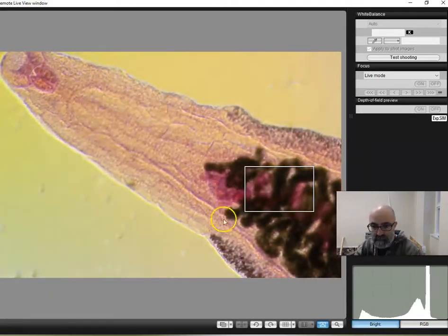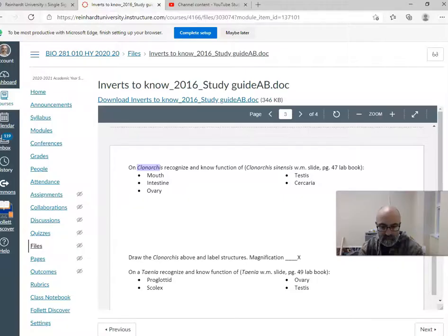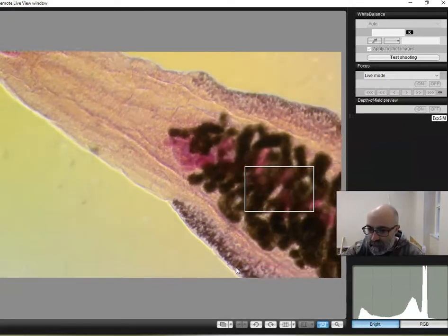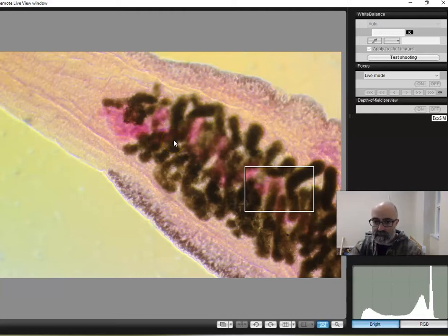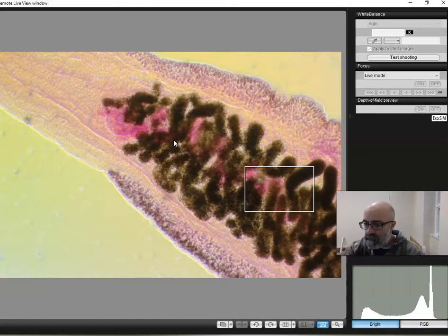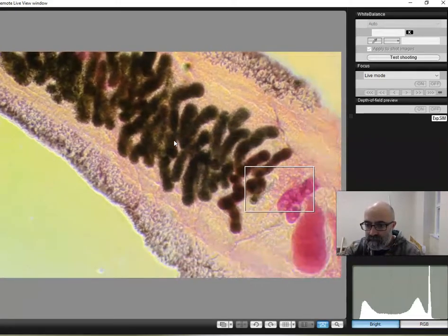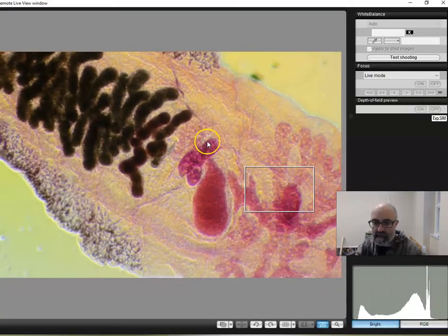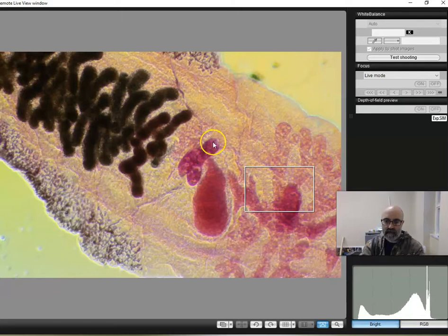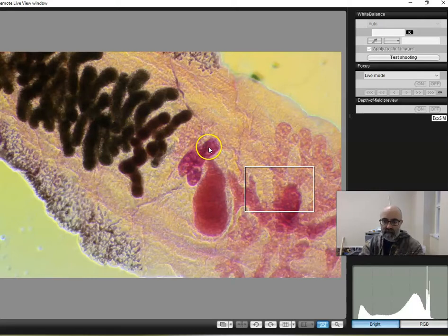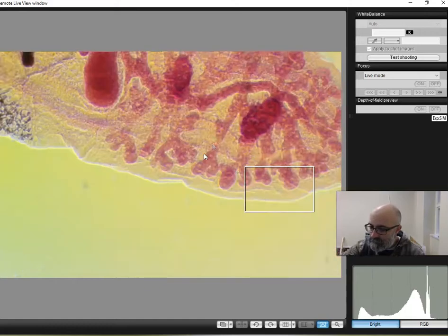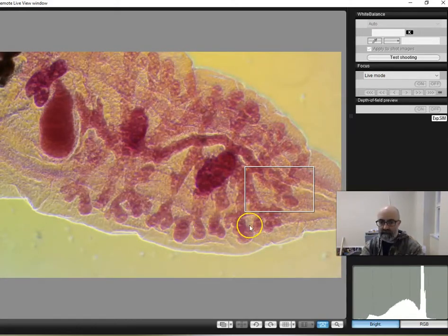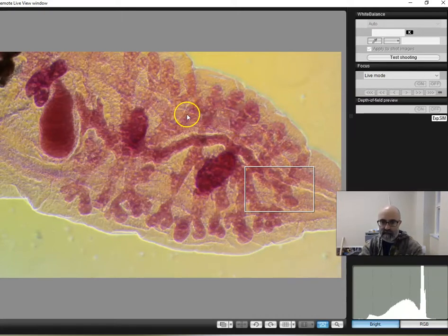So here are the intestines. There's the mouth. The ovary testis. The ovaries. All of this really dark colored tissue here is the uterine tissue. This is the uterus of the organism. If I keep going back posterior. This dark pink structure here is the ovary which produces the eggs. The uterus is where the eggs are stored. Ovary is where the eggs are produced. And the testis are all this material back here. Sort of light pink color of the testis. So sperm production here. Egg production there.